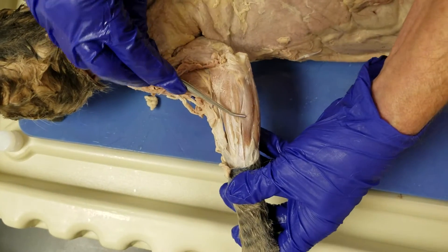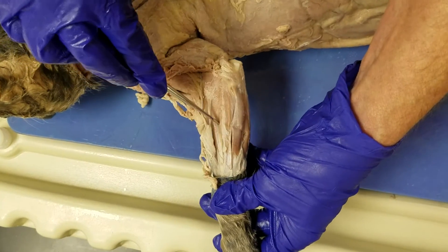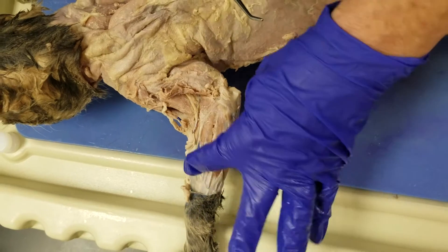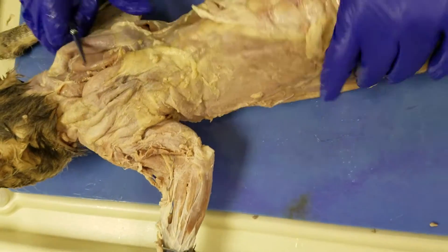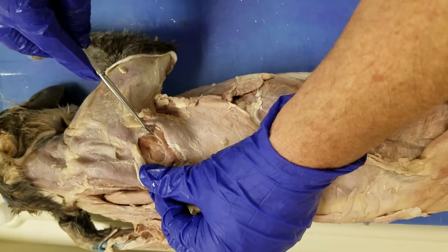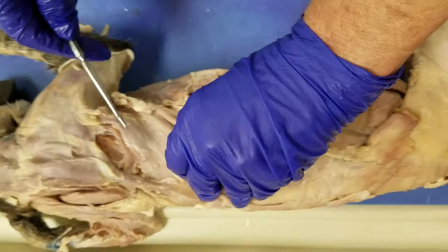Extensor digitorum, extensor carpi ulnaris, extensor carpi radialis, infraspinatus, teres major, latissimus dorsi.